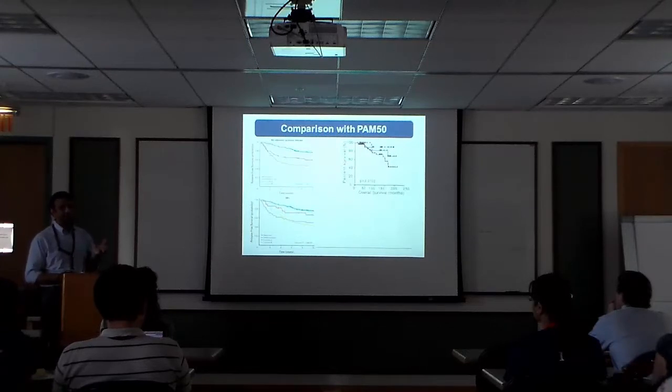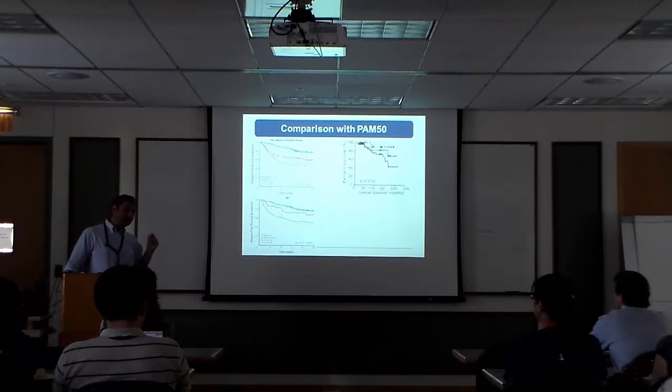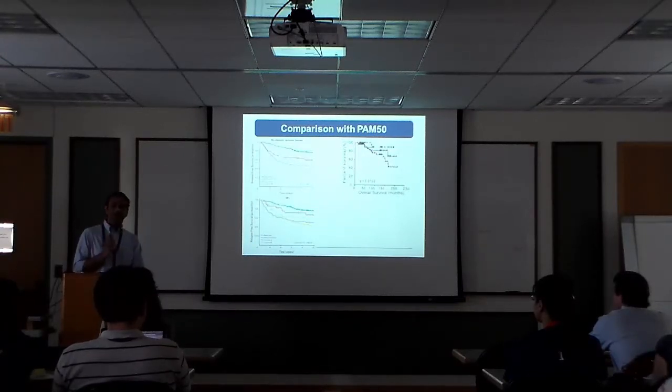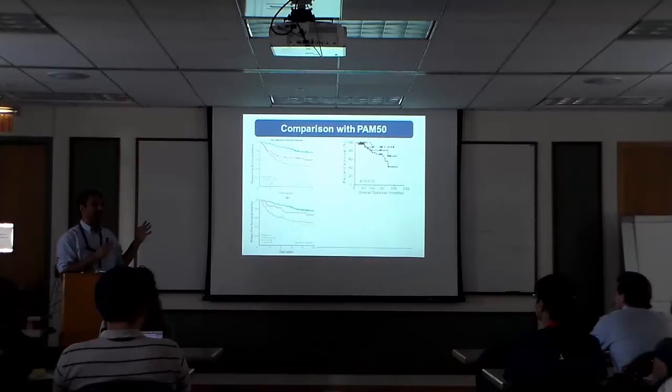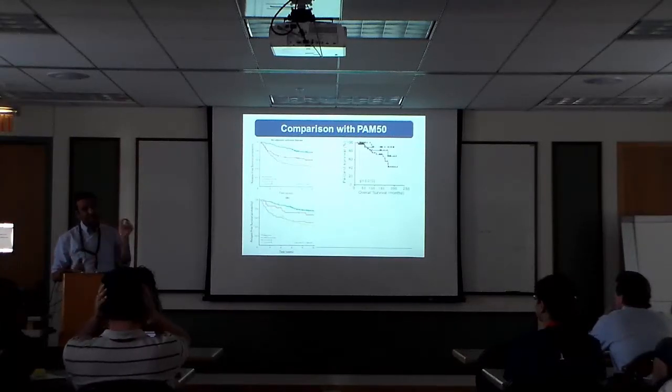So where does spectroscopy or photonics actually come in all of this, right? You're wondering now. The reason why this worked in our lab was that we put the epithelial cells and fibroblasts next to each other, and we watched it without dyes, without labels, but using spectroscopy, right? So we didn't know what was changing, but we knew nothing's changing, nothing's changing, nothing's changing. Now something's changed, right? And then things keep changing. So we focused down on that time window where there was this massive change in the middle, and that's where we obtained the time to analyze it. And that's the signature that we've actually obtained.